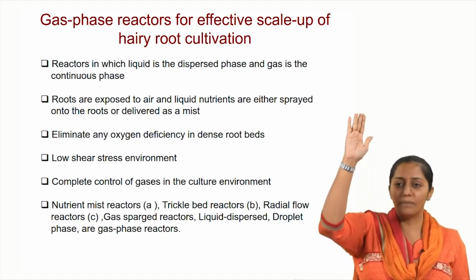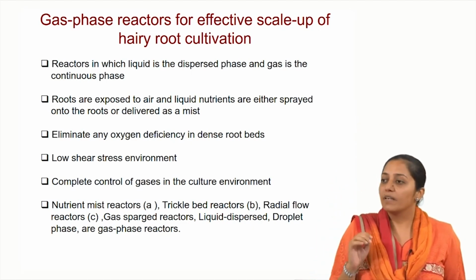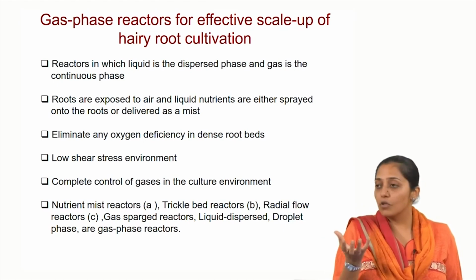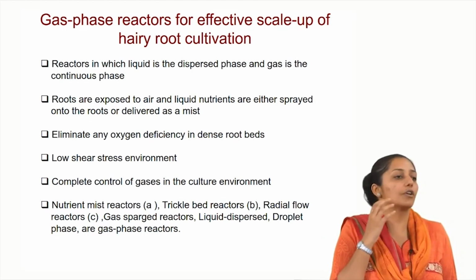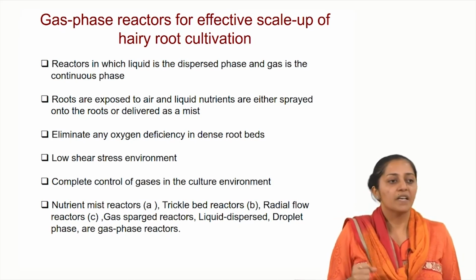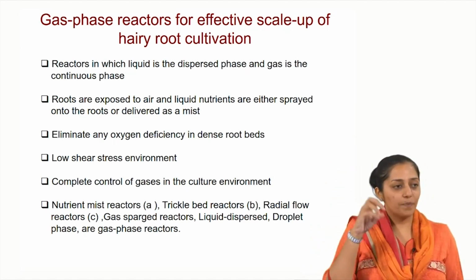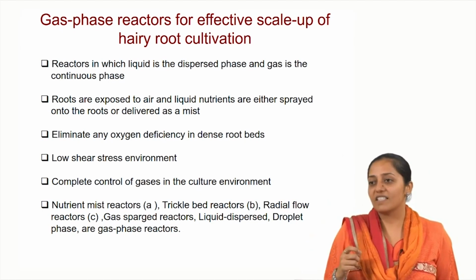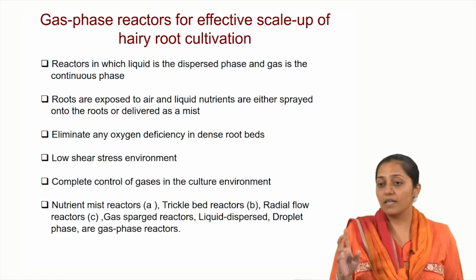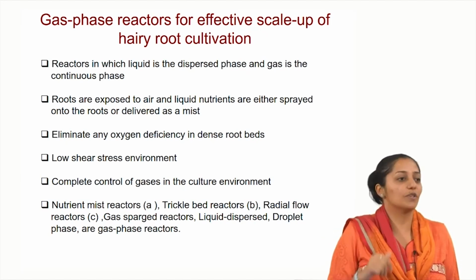It used to go up to the head plate and from there it used to fall down, the spray. But then it did not give us good results, and we saw that there was a lot of water retention onto the roots. The roots became necrotic by the end of 25 days. Similarly, we then tried putting the nozzle on top and spraying the roots with smaller droplet size. But all these configurations did not work, and the reason which we could decipher was probably the lot of water retention which was happening onto the roots.